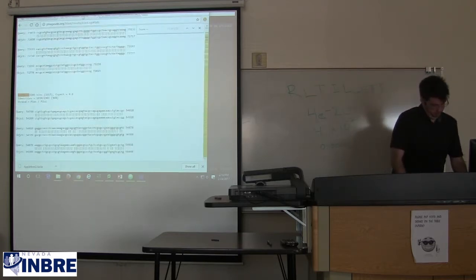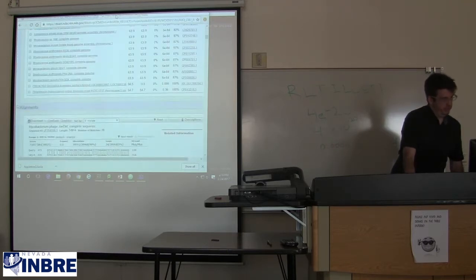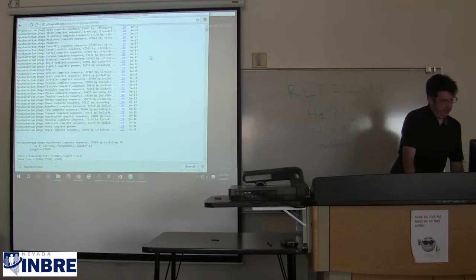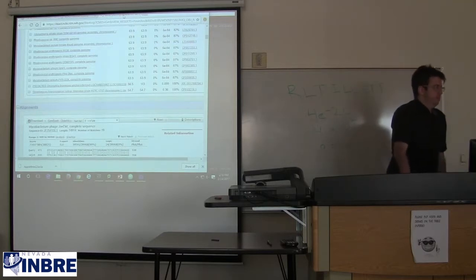Although that's not a full apples to apples comparison because we did let each one use their default algorithms, and normal blastn was used at PhagesDB, whereas the speed optimized one was used at NCBI. But I think I'll stand by that statement that PhagesDB has more sequences that are more related than what NCBI has.